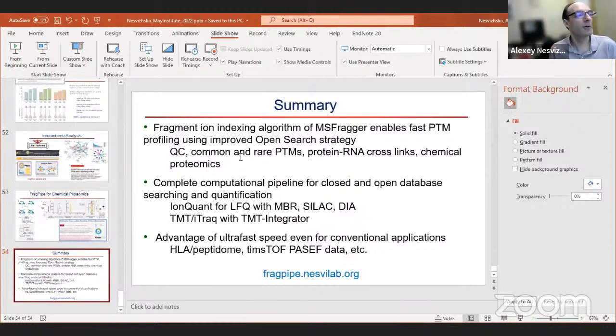Yeah, so a really good question. This again goes back to where I started in my career in this field: what are those unassigned high quality spectra? Going back 20 years ago, with LCQs, like 2000, 2001, you would probably get only 10 to 15% of MS/MS scans identified with high confidence, if not less in some challenging data sets.